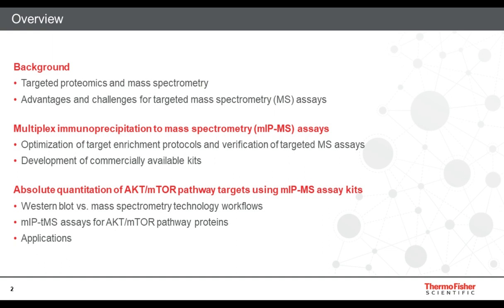And then moving on to how we optimize the target enrichment method as well as verify the different reagents to develop this targeted mass spec assay, and also how we can put together commercially available kits for this multiplex IP-MS assay. In the last part of the presentation, I will talk about how you get the absolute quantitation of these AKT mTOR pathway targets using these multiplex IP-MS assay kits.